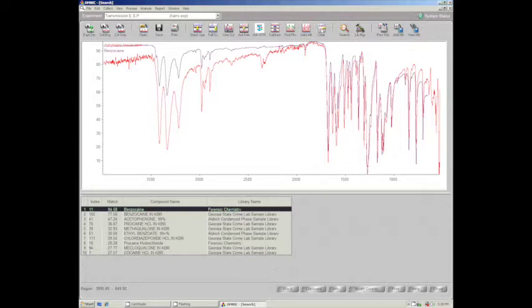What we mean by that is, even though this looks like a good match, it's not your spectrum. You don't know if it was run under the exact same conditions. So we think it's benzocaine. Now you go get the benzocaine standard, make a window of that, and analyze it under the exact same conditions that you analyzed your sample. And if those two spectra match when they're overlaid, then you can call it positive.